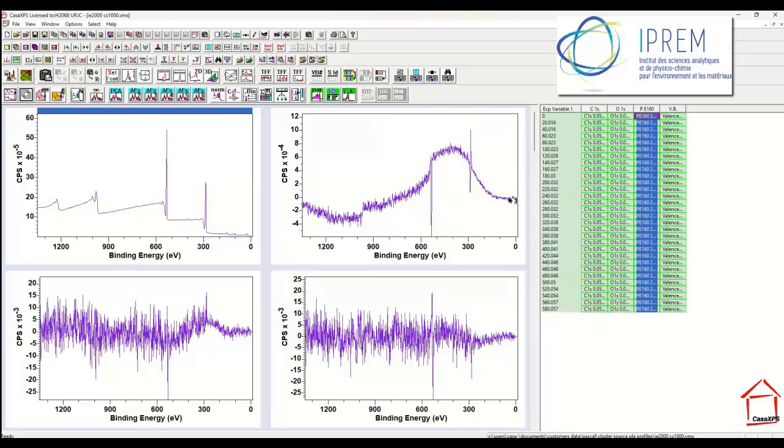but what we do see is the change in the background that is a consequence of these photoemission peaks emitted from silicon scattered throughout the silicon and the overlayer of the carbon polymer. And the result is a distribution of signal to lower kinetic energy that will alter the background to the data.